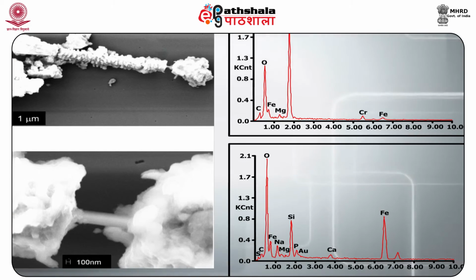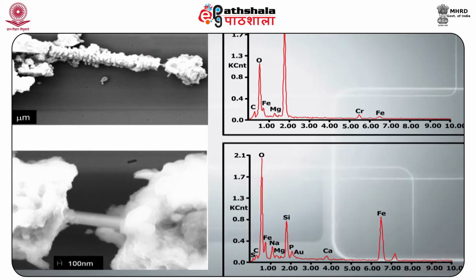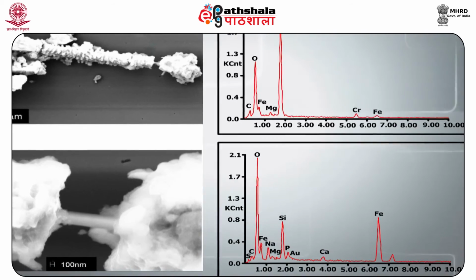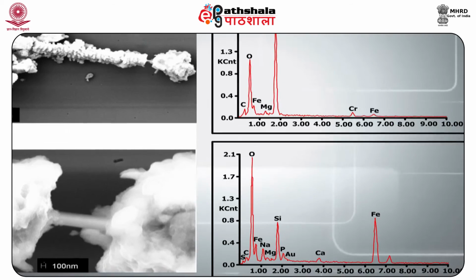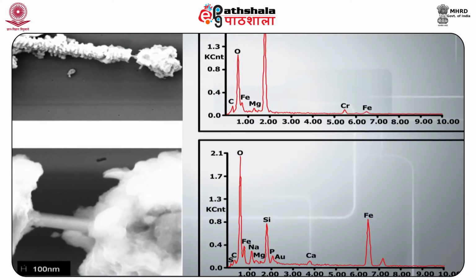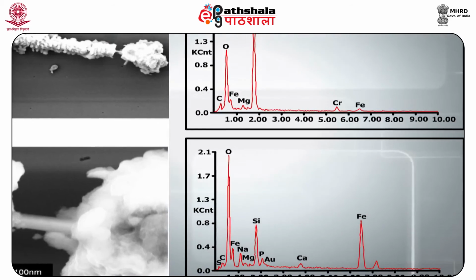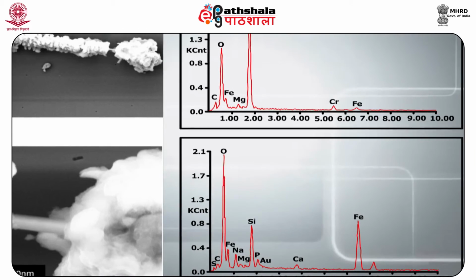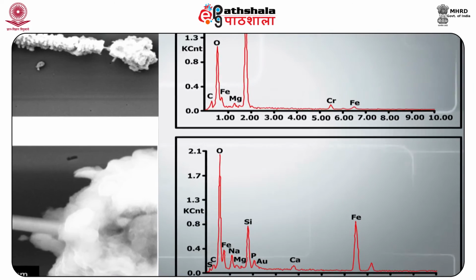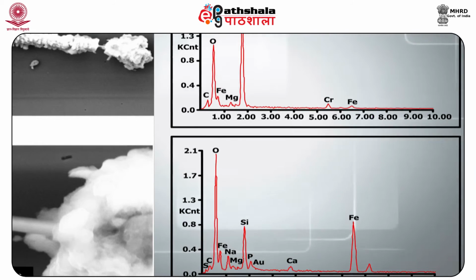This X-ray detector measures the energy in each photon of X-ray radiation, and these quanta of energy can be stored electronically. A histogram of number of quanta versus the energy can be drawn. From this histogram, elemental analysis of the particles under examination can be determined.